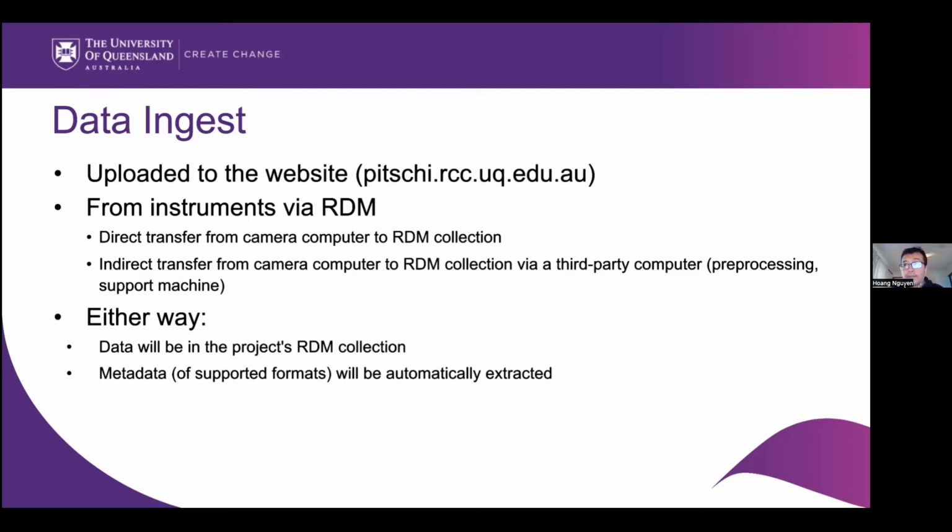With a bigger data set, the data can be captured directly from the instrument computers and then uploaded to the project's RDM. With this, we provide two methods: either a direct transfer, or an indirect transfer, depending on the configuration of the machine. And I will explain the differences in a couple more slides.